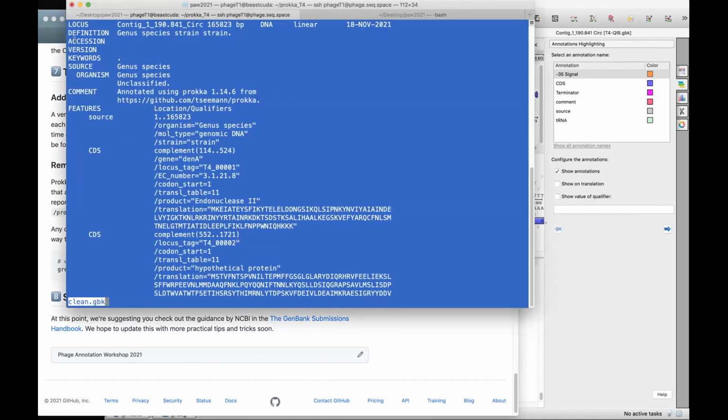Accession information gets added automatically after submission, so these are things that you cannot add. When you do a submission, there's also the publication in which your genome is first described that you can add, and that will also come in this front bit.